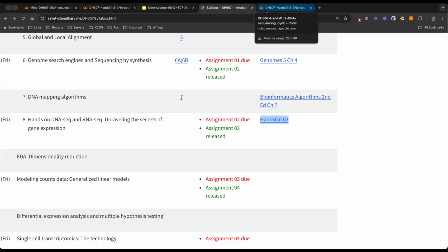I'll give you a very brief review of how I found this data set. I was looking for data sets coming from a technology called whole genome sequencing. Nothing very fancy, it's basically DNA sequencing. You're doing it for the whole genome, so that's why it's called WGS, or whole genome sequencing. And I'll show you in a bit how I found this data set, or how you can find data sets of interest going forward.